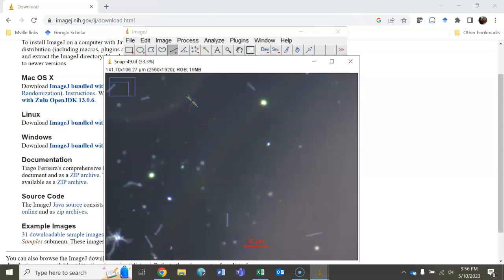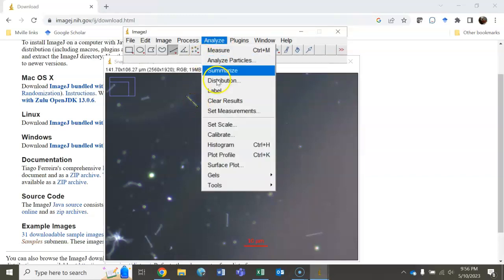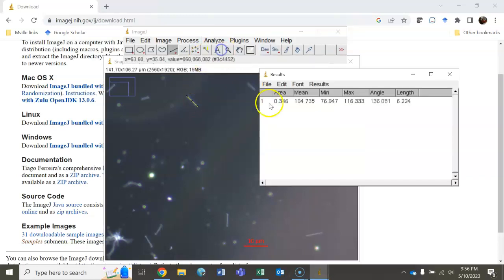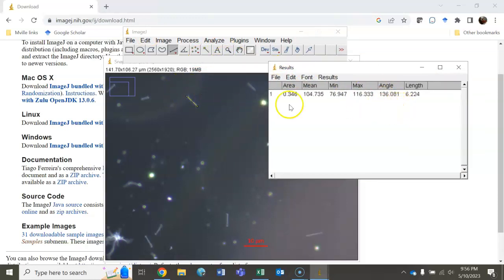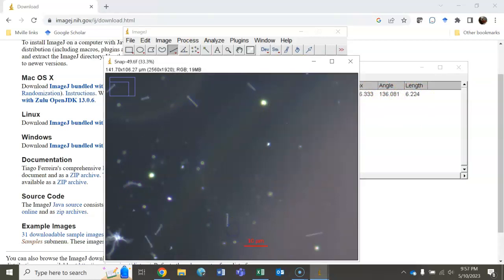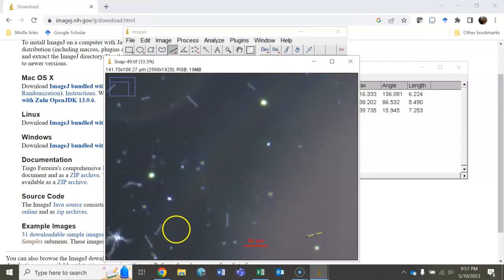If I click control M, or I go up to Analyze and click Measure, it's going to give me a measurement. You can see this window pops up with our results. It's saying that this spirochete is 6.224 micrometers in length. We can see there's another spirochete down here, so I can measure that one as well. I can measure this one as well. You're just going to keep on doing that.